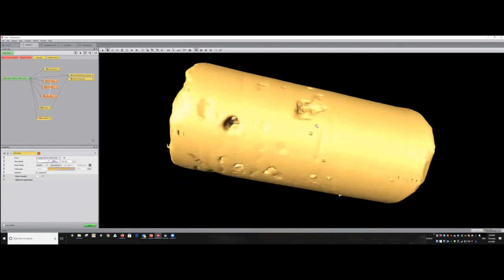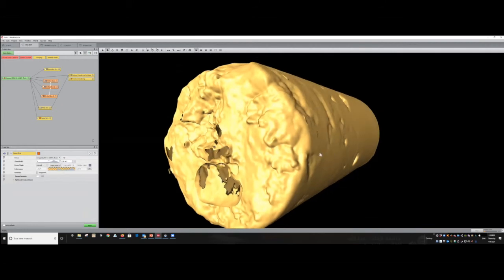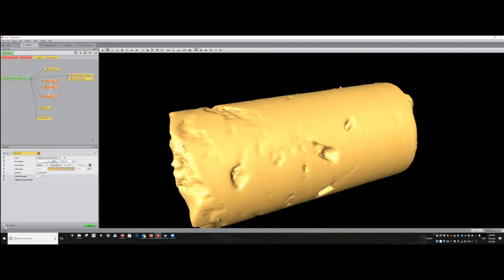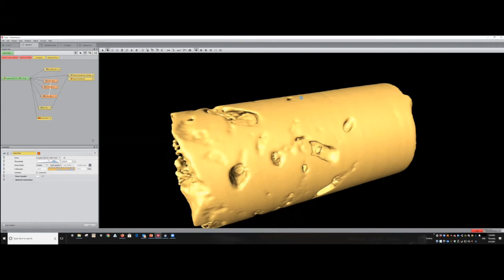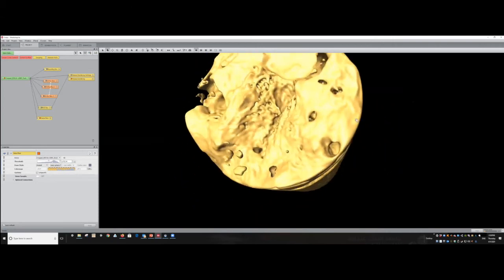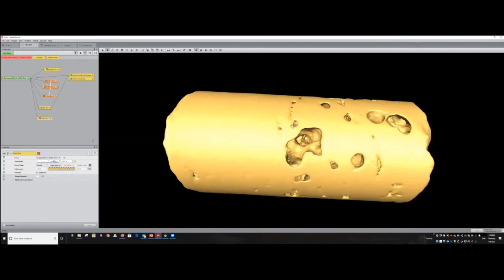you'll get the isosurface. Over here, the threshold value is basically the value of the ISO line that the Avizo will compute, and it will draw the surface of that value. So if I click on the auto refresh here, and I just want to show you quickly, if I change the threshold value, you can see that the surface changes.